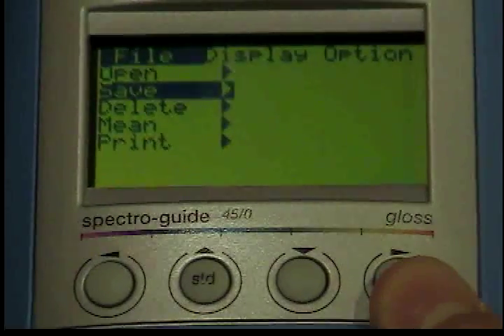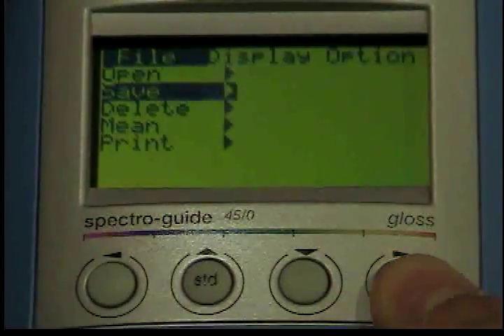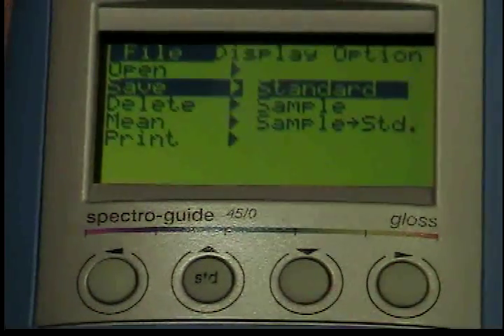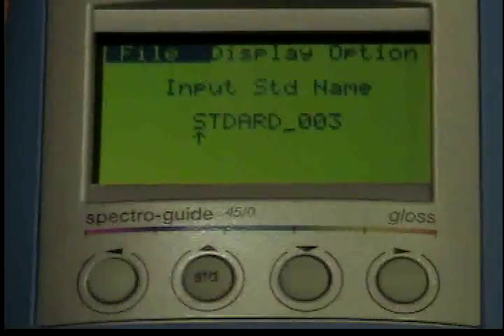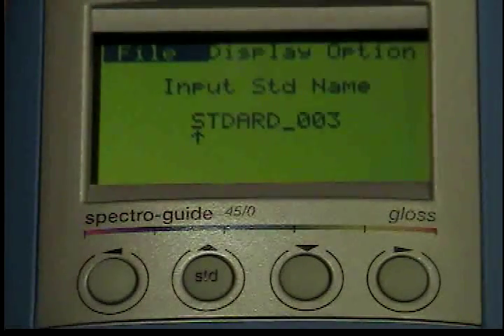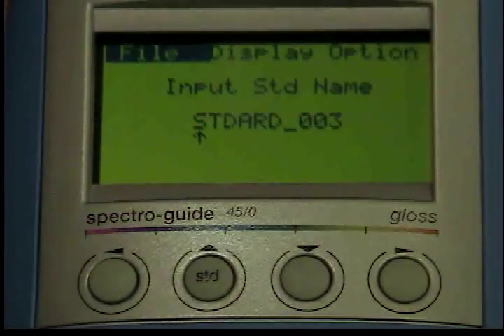Choose standard and press the operate button again. The input menu will appear for the standard name you will now select.